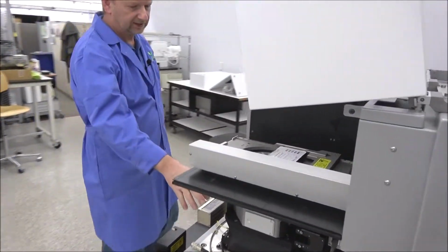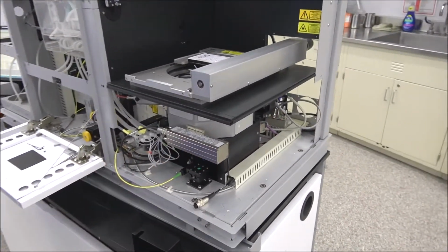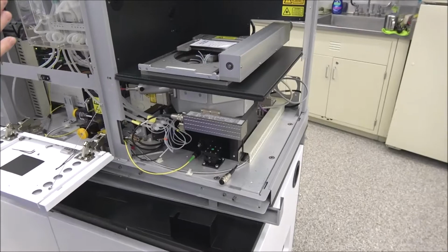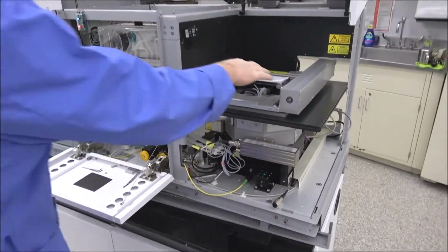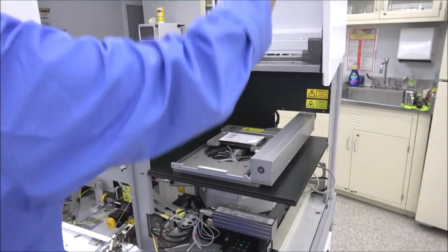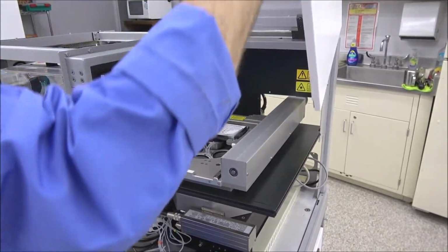And first thing I said, like, the check is the actual reader meter inside there. Make sure that laser is hitting dead on, right on that meter. But like I said, we have our Opera adjustment plate in there. We're just going to look at some of the beads in there and kind of show you.